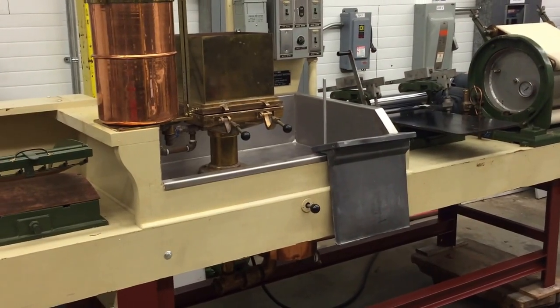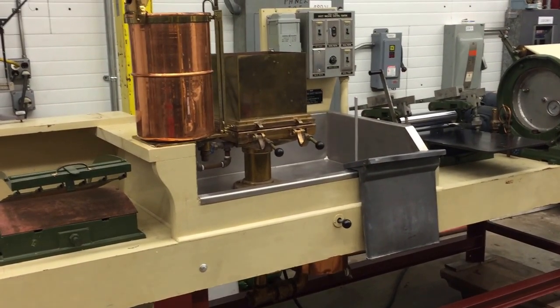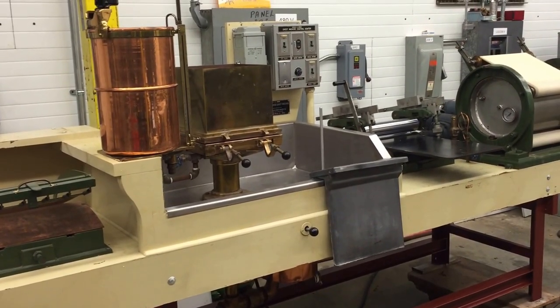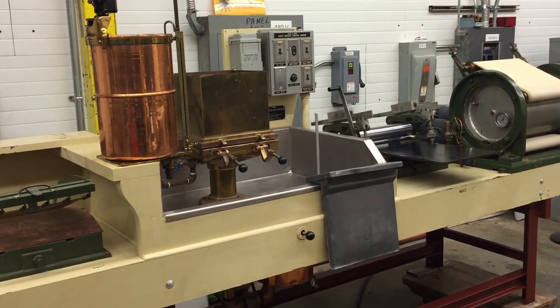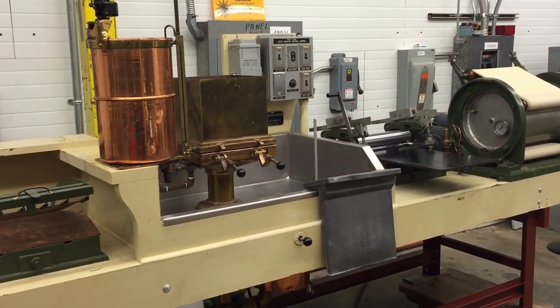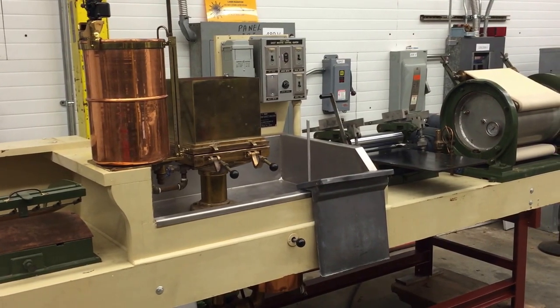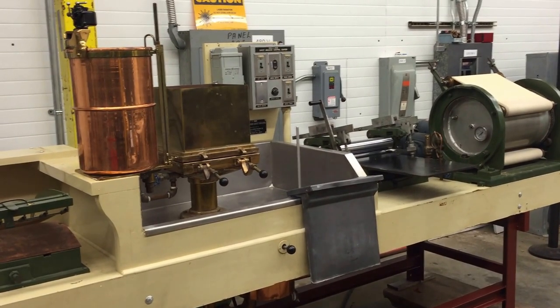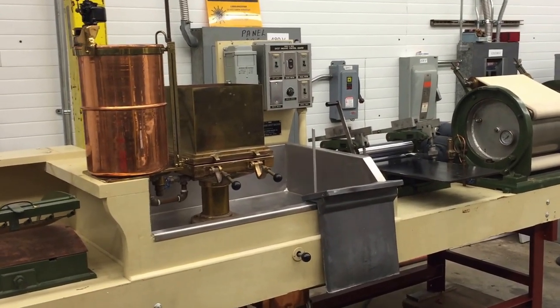This is a used paper machine for making accurate test sheets of paper from a sample of pulp stock. The machine was commonly used in pulp and paper mills, chemical manufacturers, and paper labs, but it could also be used by an artist or school for making decorative handmade paper. Since the machine was built a few decades ago, it was constructed with many high quality materials such as brass and copper, as well as heavy-duty castings.